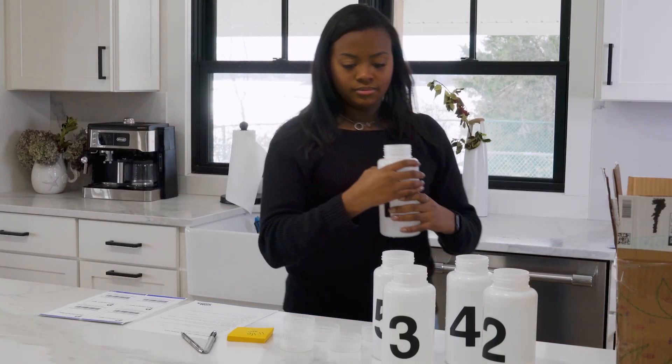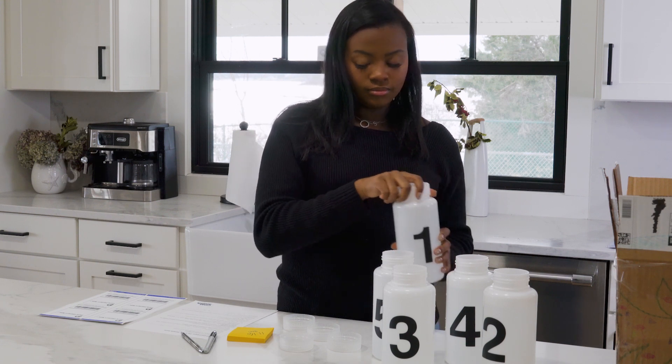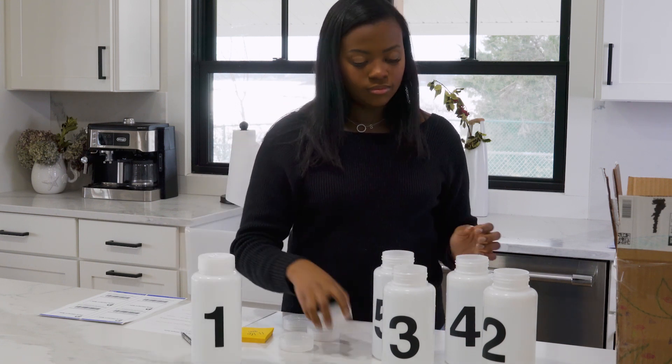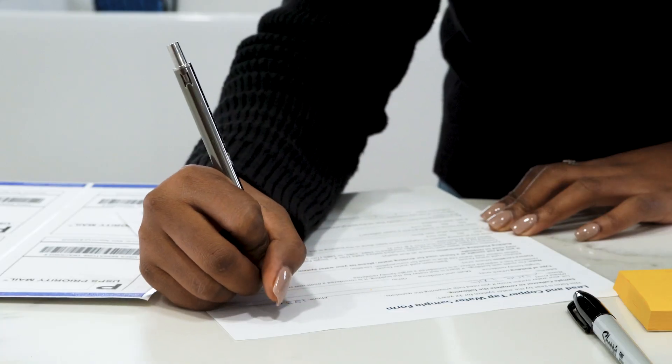After all the bottles are filled, replace the caps without touching the inside of the bottles with your fingers. It does not matter which cap goes on which bottle. Next, complete the sampling collection form.